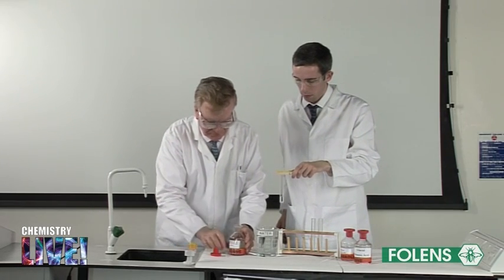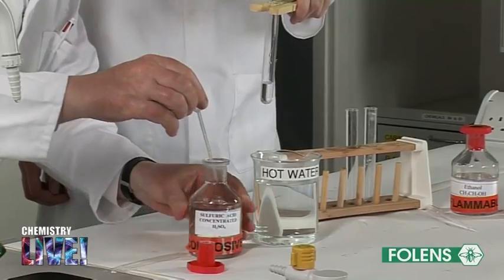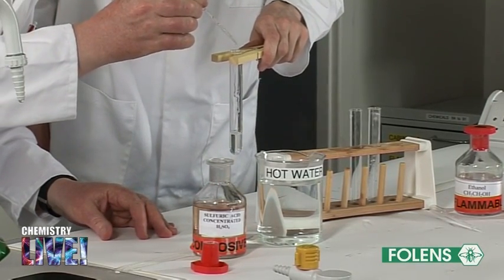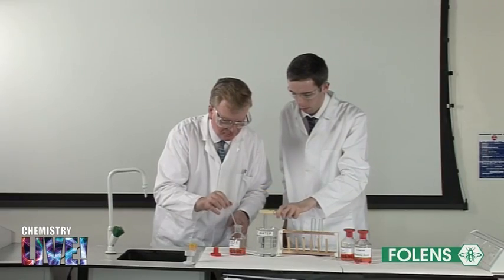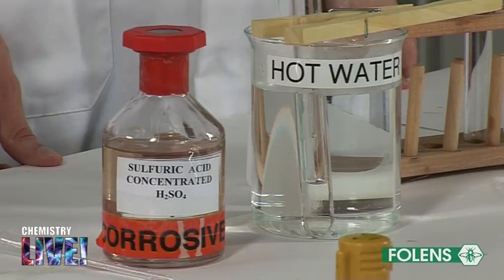Add 3 drops of concentrated sulphuric acid to the test tube. The sulphuric acid acts as a catalyst for the reaction between the ethanoic acid and the ethanol. Place the test tube in a beaker of hot water for about 10 minutes.